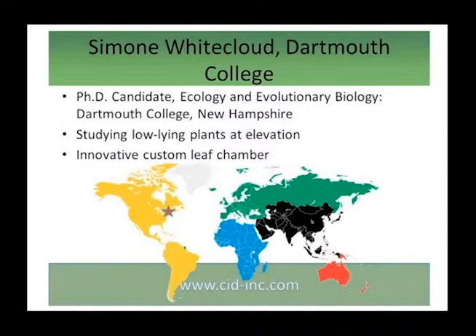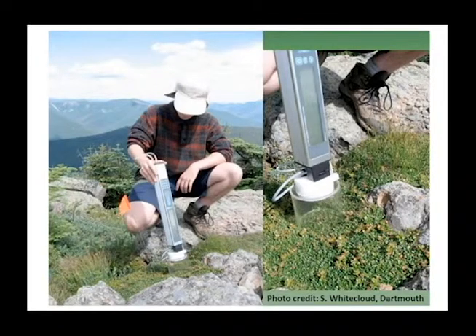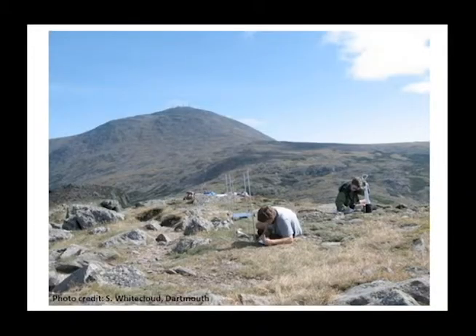So Simone actually made this leaf chamber the same size as the soil respiration chamber, which a colleague of hers has at Dartmouth College. And so this will allow her in the future to do more research using both of these chambers in conjunction. For now, if you look in the back here, we can see her measuring with the handheld photosynthesis analyzer.